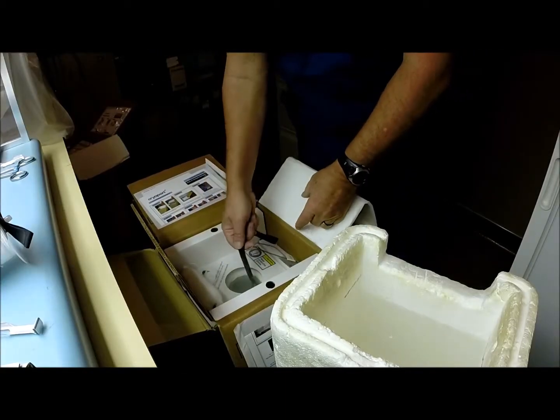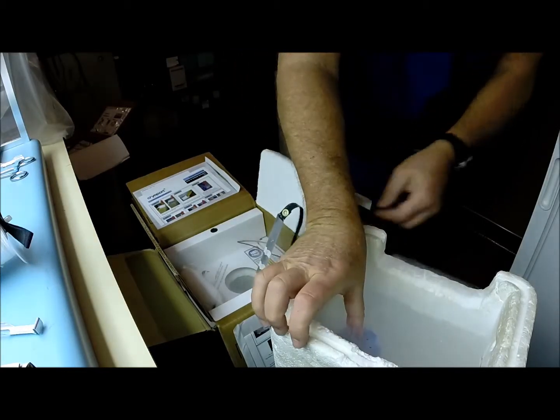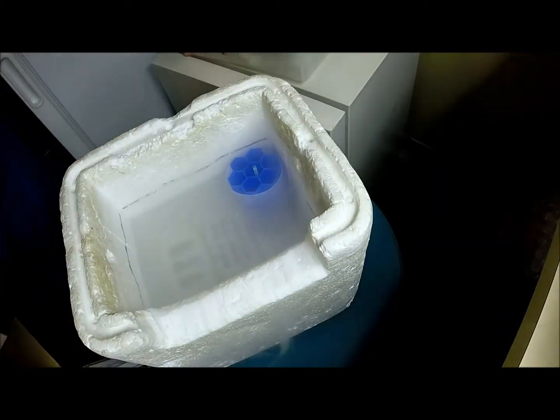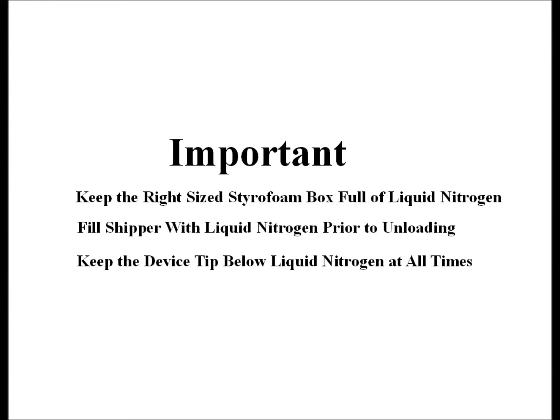Now pull on the black strap connected to the metal lifter. Be sure that your transfer box is very close to the shipper. Raise the goblets, grab the center goblet, or move the entire canister quickly into the previously prepared transfer box. At this point, the devices should be moved into the new goblet with cooled tongs — all of this should be done below the level of liquid nitrogen. A top should be placed on the storage goblet to keep devices from floating; this top can be either a cryovial or another goblet turned upside down. The storage goblets should now contain liquid nitrogen and have a top on them, and can be quickly moved into their storage locations.